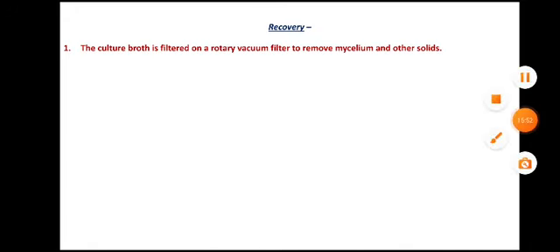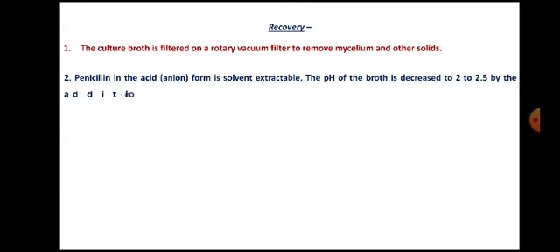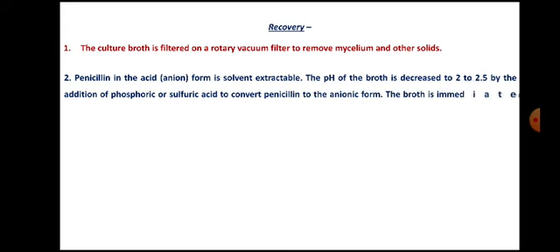Then the recovery of penicillin. After the fermentation is over, the culture broth is first filtered on a rotary vacuum filter to remove mycelia and other solids. The second step is separation of penicillin from the aqueous medium, that is from water.